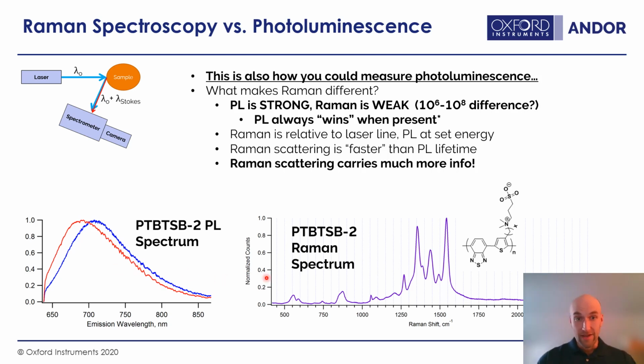On the other hand, here's the same molecule's Raman spectrum. Technically, this is a resonance Raman spectrum. Don't tell anybody. For our purposes right now, that's okay. It carries much of the same information as the Raman spectrum, so ignore that for the moment. Here you see, instead, these units are in Raman shift in centimeters to the minus 1. What's that all about? We'll go into that in a minute.